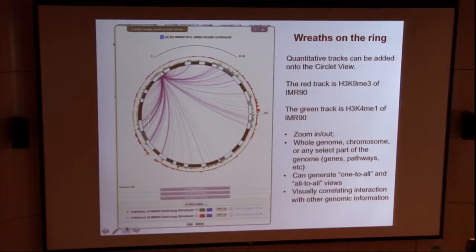In addition, this shows this location is interacting with all the other locations on this chromosome. And on top of that, we can now decorate this circlet with genomic data, RNA expression data or histone modification data, DNA methylation data, allowing you to get a full picture of the data and also allowing you to jump in and zoom in to specific parts and look at the interaction and then look at the epigenomic data.